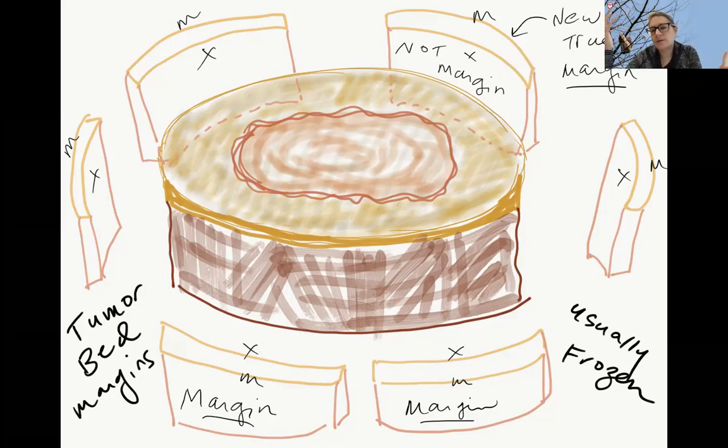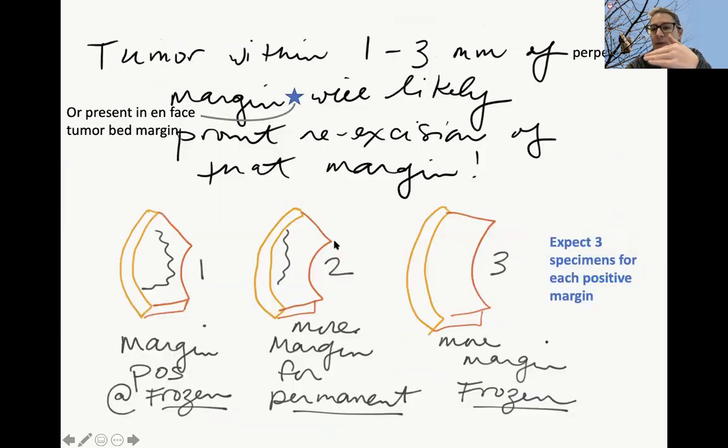It's always a little bit of a guessing game unless they orient it, but you just freeze it. Okay. But theoretically, it also has a direction, right? But since we don't know that direction, we can't provide them that information. Sometimes when they take a huge new strip of margin, they will orient, you know, this side is new true margin, this side is cavity.